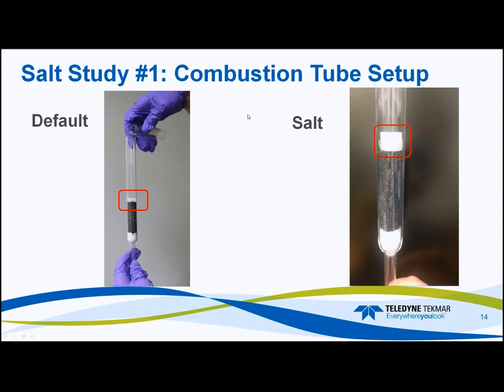Now, the difference between these two: 3 grams of quartz beads cost about $12. A platinum screen and a quartz retaining ring costs about $112.